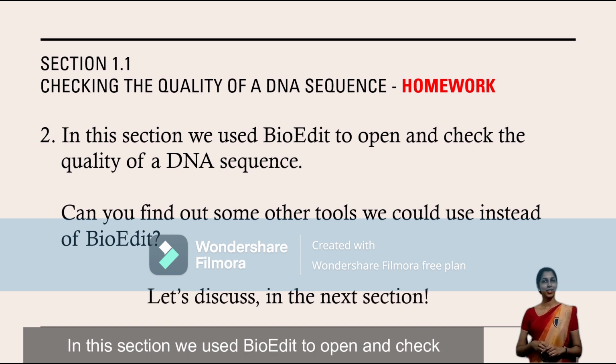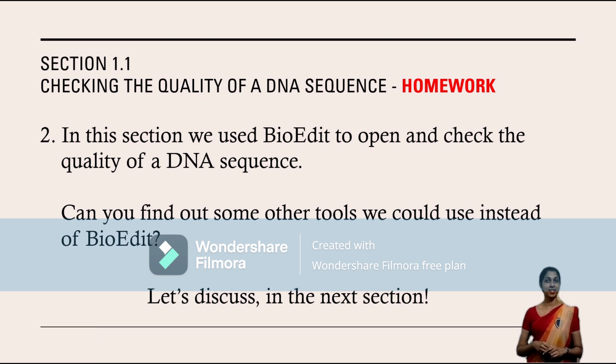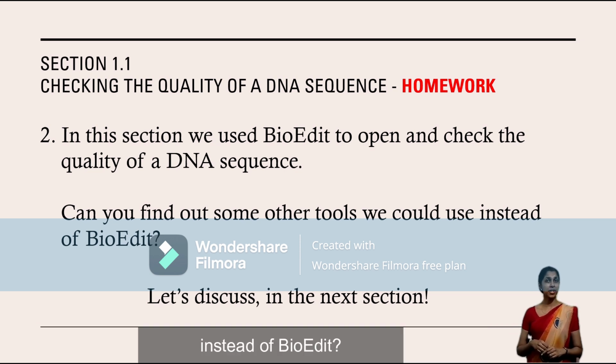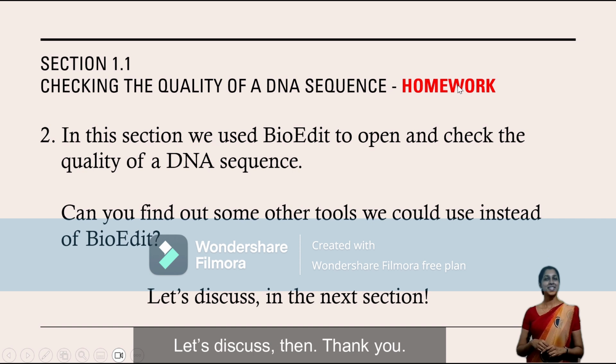In this section, we used BioEdit to open and check the quality of a DNA sequence. Can you find some other tools we can use instead of BioEdit? I will be discussing some of them in the subsequent sections. Let's discuss then. Thank you.